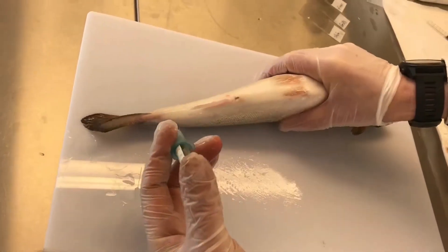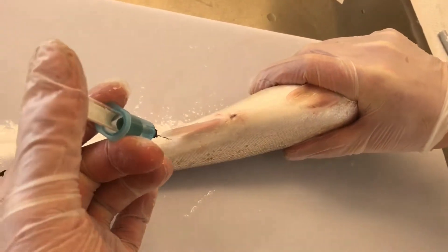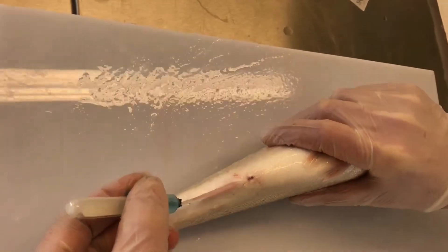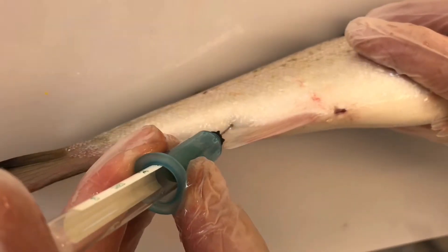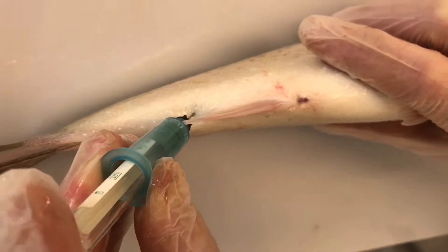Now we are going to take the blood. Evan is using a vacutainer and he's trying to insert the needle just behind the anal fin, inserting until he reaches the vertebral column.